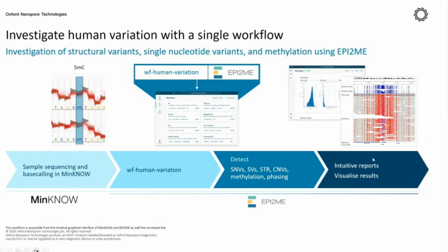After this pipeline, reports will be included at the end of the pipeline, and then the analysis results. If you are familiar with other human whole genome sequencing technologies like short-read sequencing, then the output from this pipeline will be very similar to those as well. So you should have no problem using your preferred downstream analysis tools like IGV or maybe Cue variants and so on, to handle the data or results coming out from the pipelines.